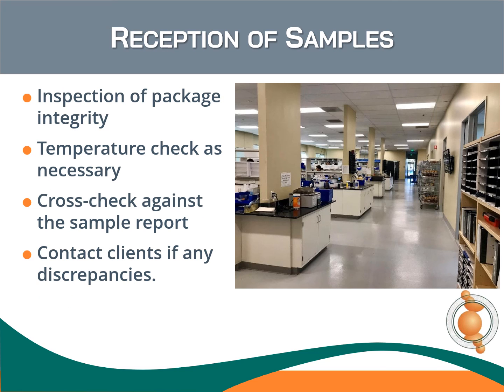Upon receipt to the lab, AEMTEK laboratory technicians inspect the integrity of the package containing samples. Temperature checks are performed on samples that require refrigeration or freezing. Our technicians then perform a cross-check against the sample report or chain of custody form and physical samples. Our account manager contacts clients if there are any discrepancies.